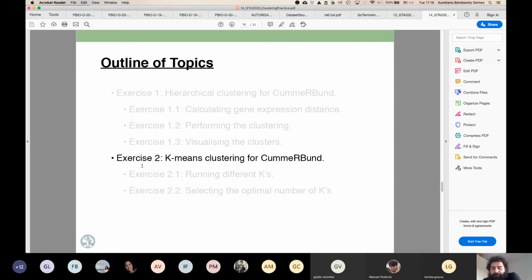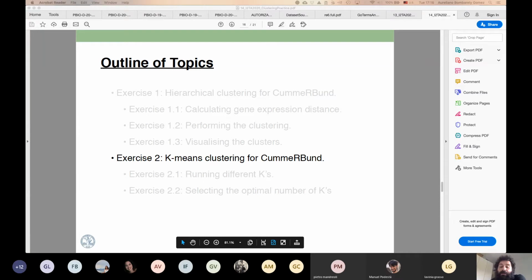Other question? Okay. Yes, one. The ggplot function gives me an error, but it plots correctly the cluster. I don't know why. I pasted the error in the chat. Yeah, I mean, I don't know. As I said, ggplot is quite tricky, and sometimes it takes some time to polish them. Oh yeah, no, that is not an error. It's a warning. It's the same warning that I have. Okay, no problem.